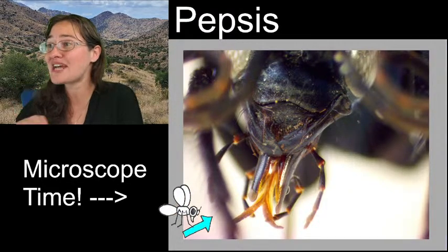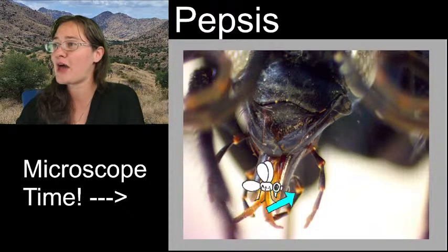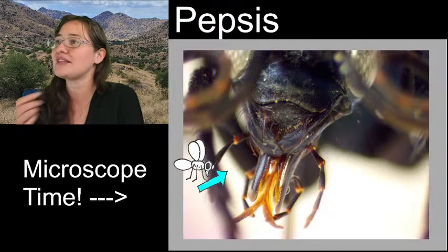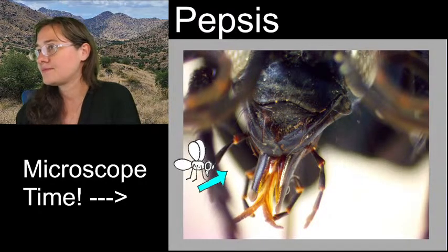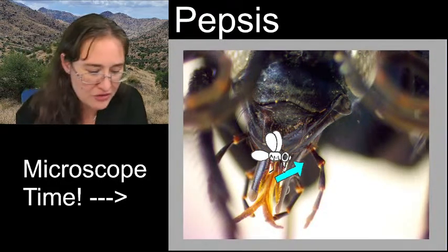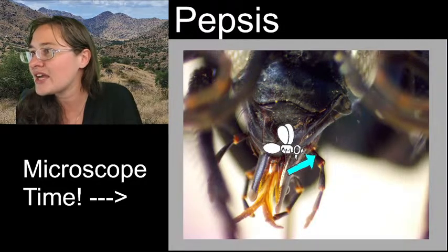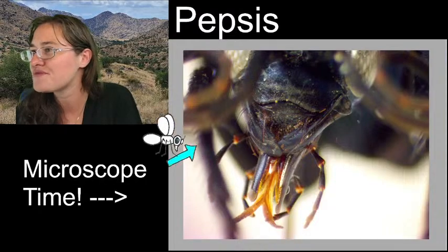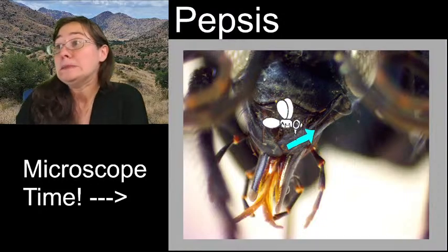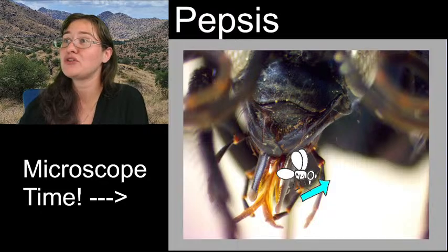And from this angle, you can definitely see all four mouth fingers, all of these palps. So you've got the labial palps down here on the bottom, because they're connected to the bottom jaw. And then you have the maxillary palps up here, which I thought originally were three segmented, but looking at it from this angle, they look like they're 1, 2, 3, 4, almost 5 segmented. They look like they're 5 segmented from this side, and I would definitely say this is a better view than we were seeing from the other side.